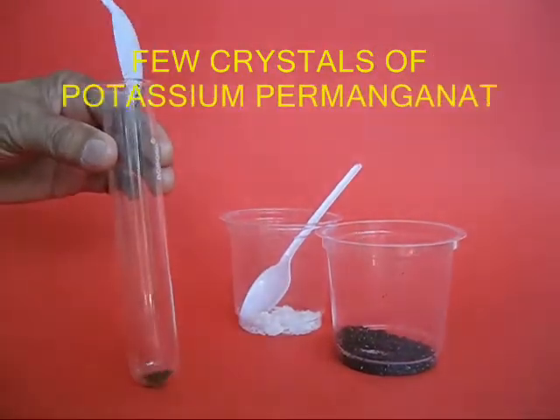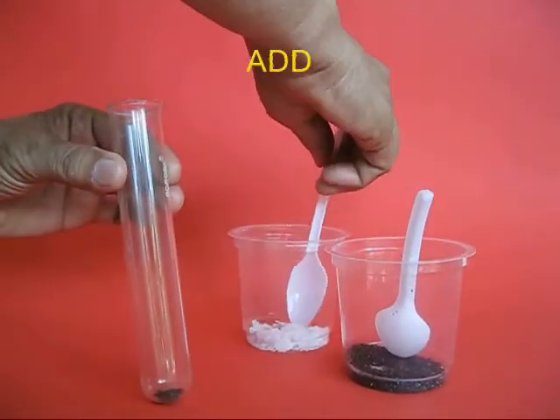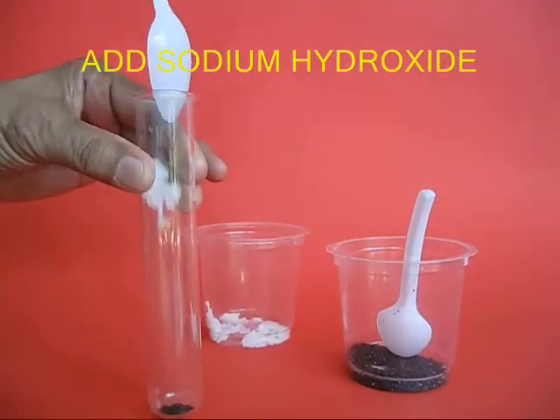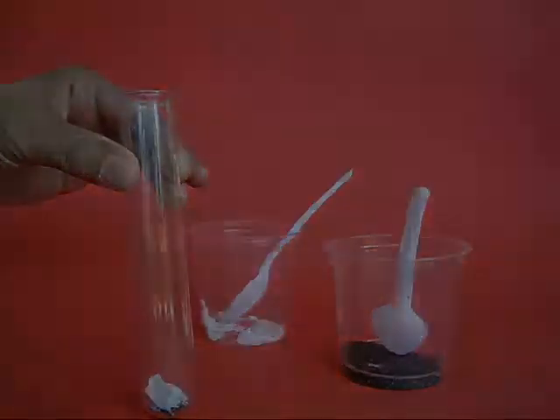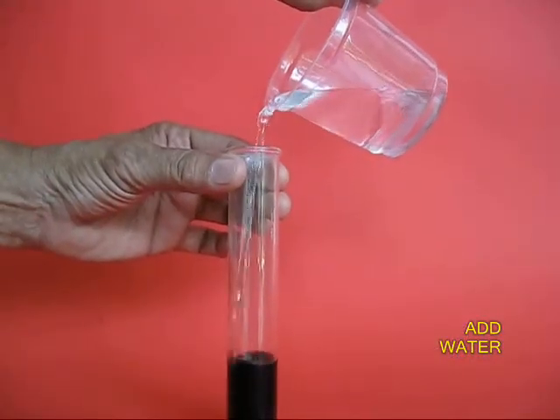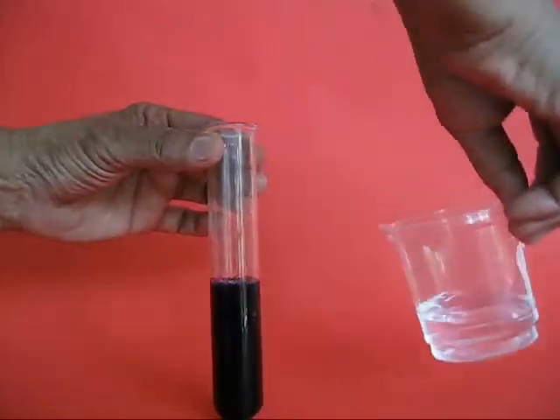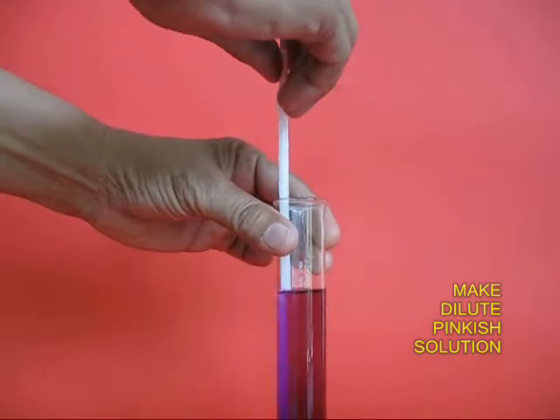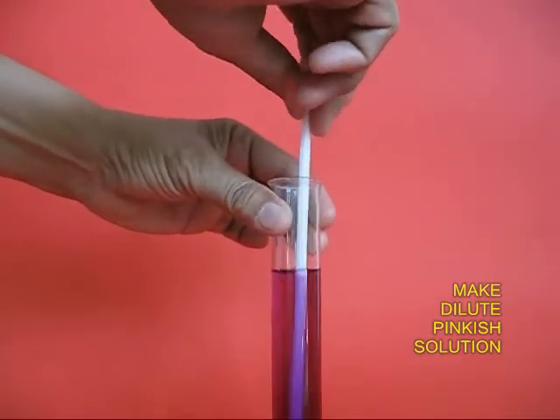Add a few crystals of potassium permanganate to a test tube and also add some sodium hydroxide. Add water and you will get a dark purplish liquid. Dilute it to make a kind of pinkish solution.